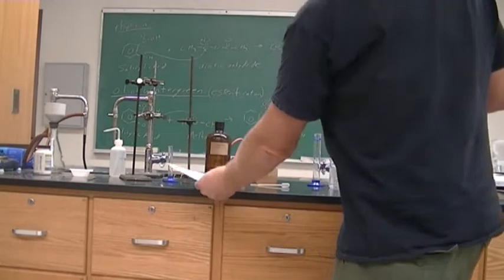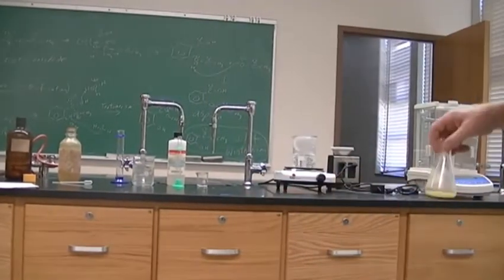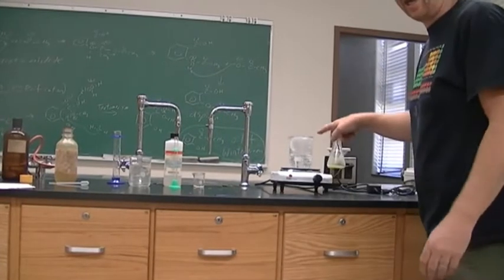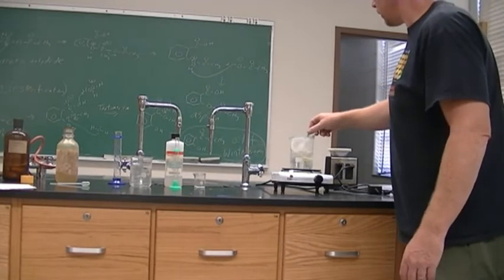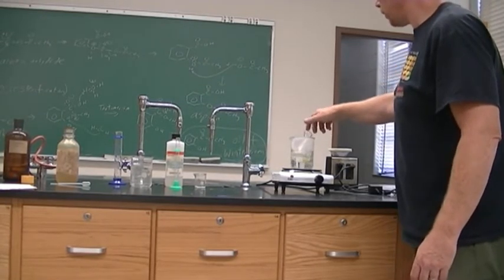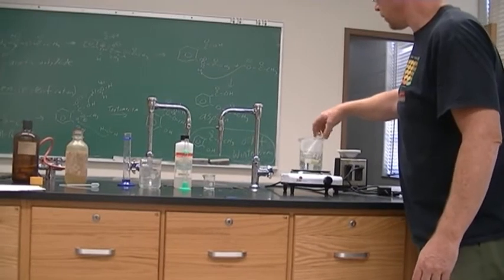And now over here, I have a hot plate and I have a beaker of boiling water. And so we're going to put this in this beaker of boiling water for 15 minutes or until all of that dissolves.